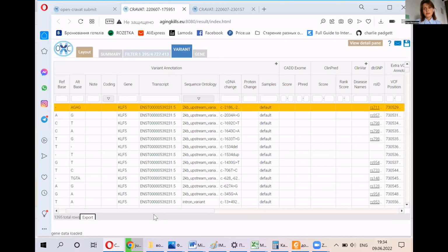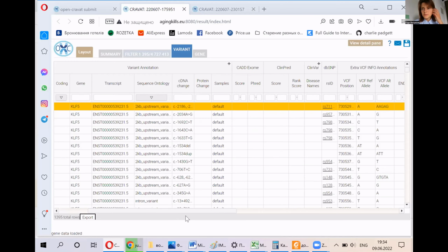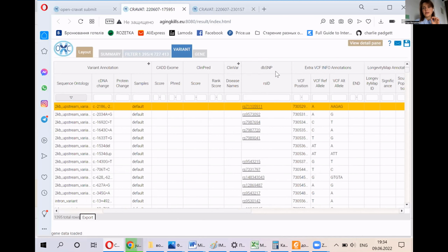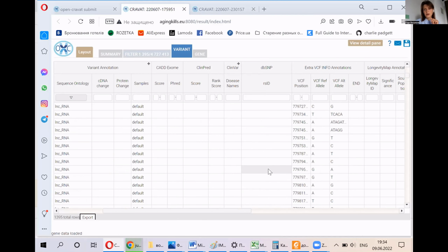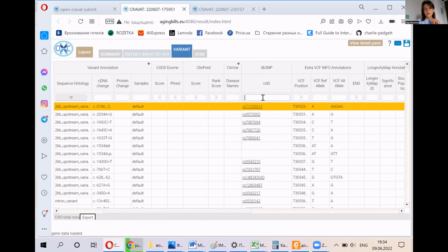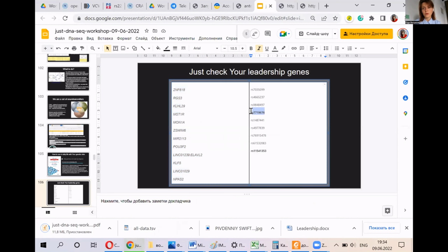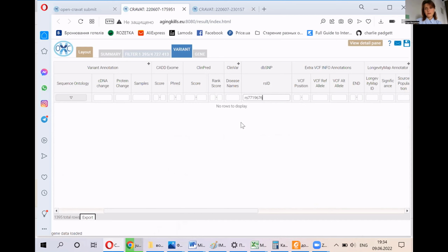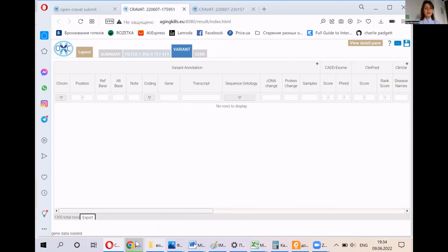So, but you also have here the RSIDs, which are or are not in this article. And having them from your article, you can just check whether you have these substitutions or not. So kind of that stuff. So maybe you're not having or having them, etc.